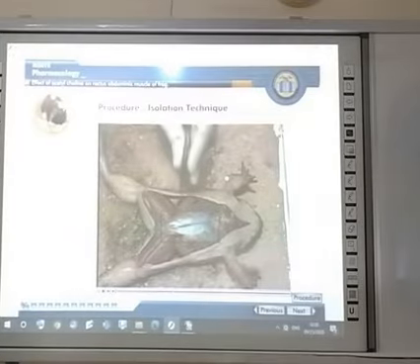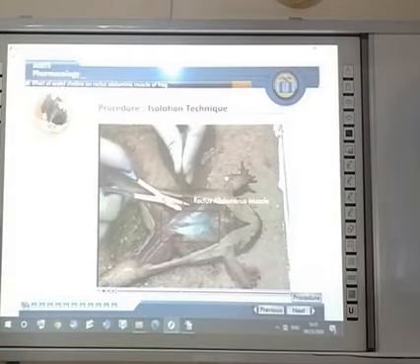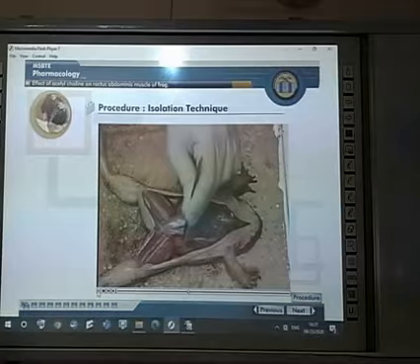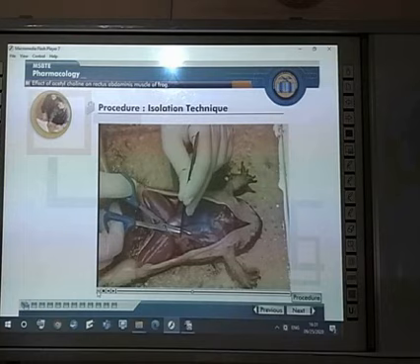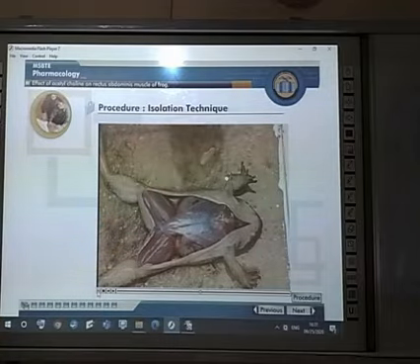To isolate the rectus abdominis muscle preparation, take a side cut on the rectus muscle. One can prepare two muscle preparations from a single frog.